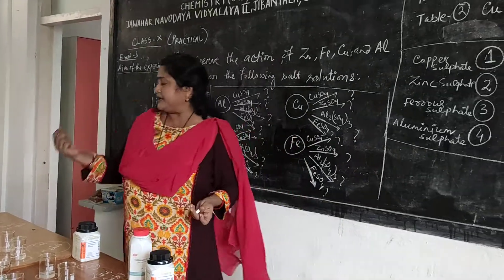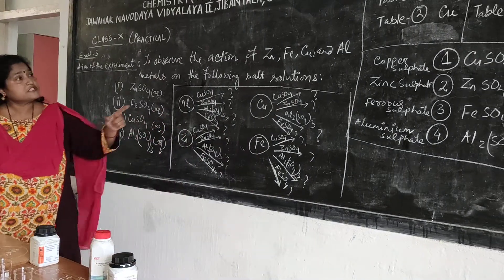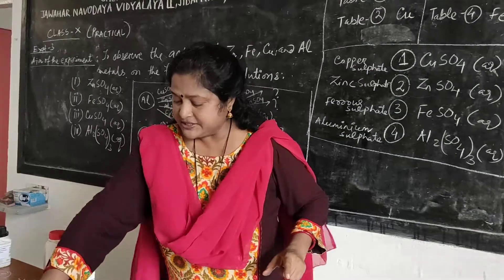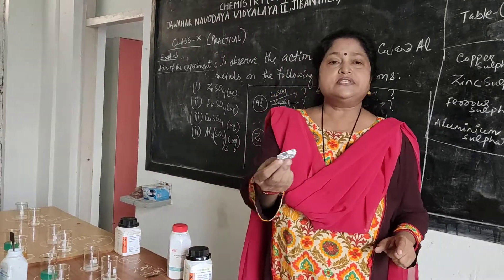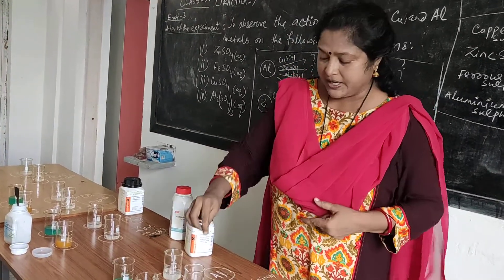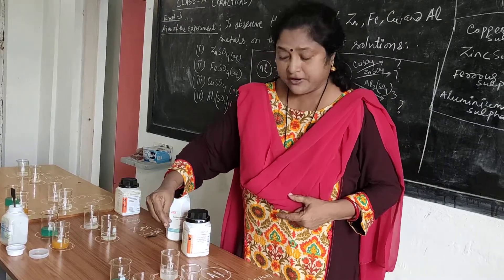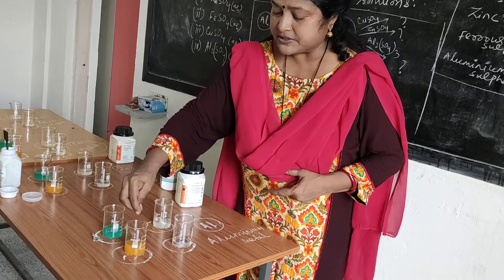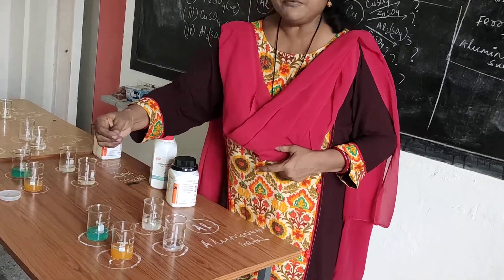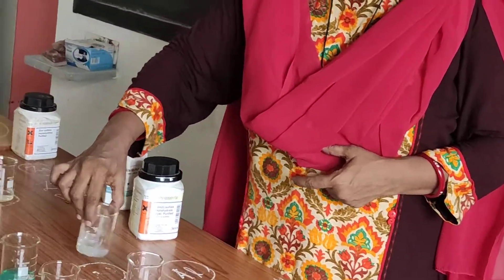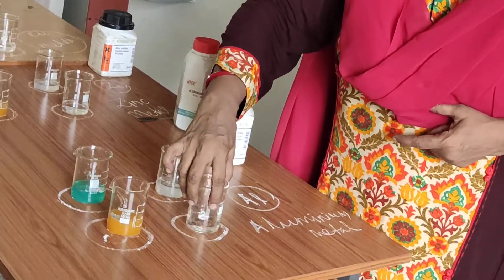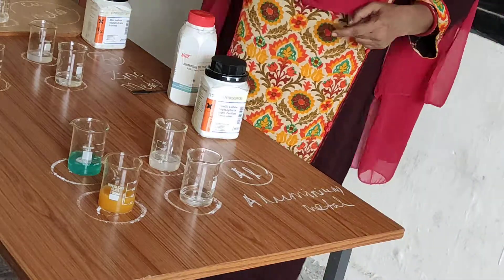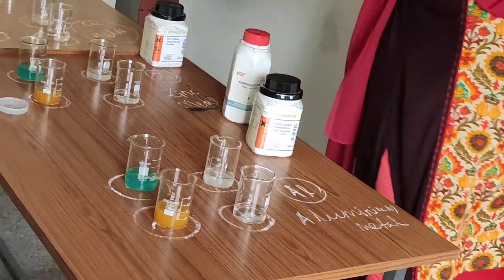Now I have taken the metals. For table 1, I have taken aluminium metal. I am putting aluminium metal into all four beakers here — please focus. I am allowing it time for the reaction.